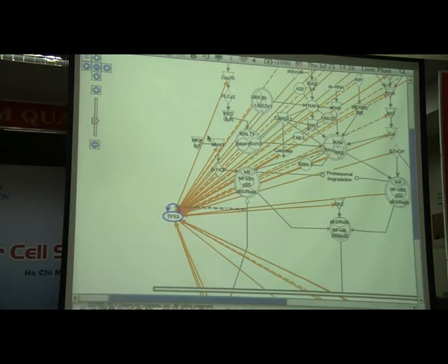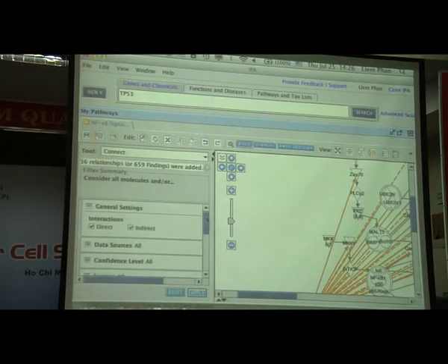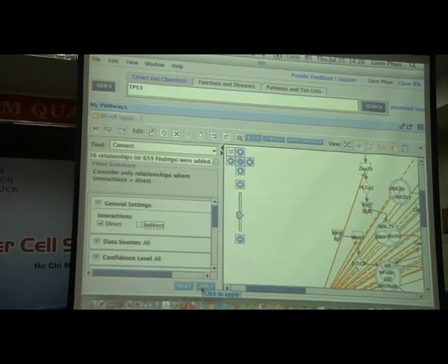Okay. So in doing so, you go back here, and we're going to select just direct. And click apply again.